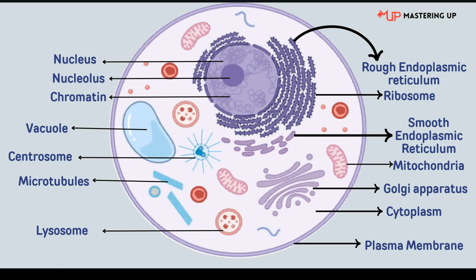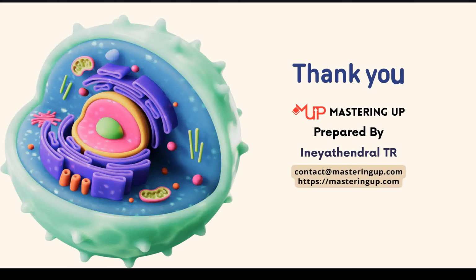Understanding these structures is key to appreciating how animal cells and indeed all living organisms function at a microscopic level.